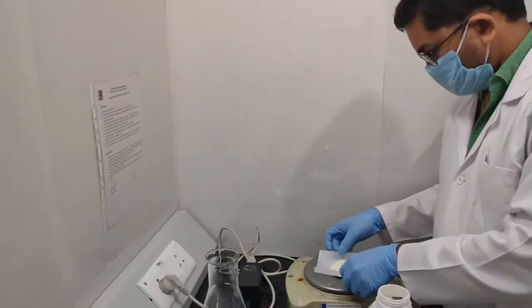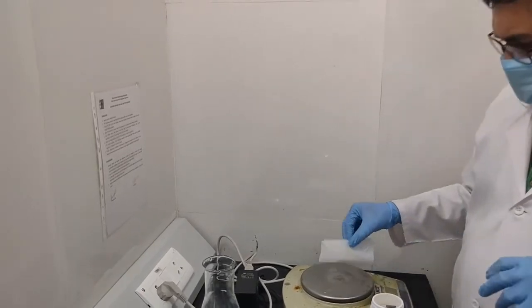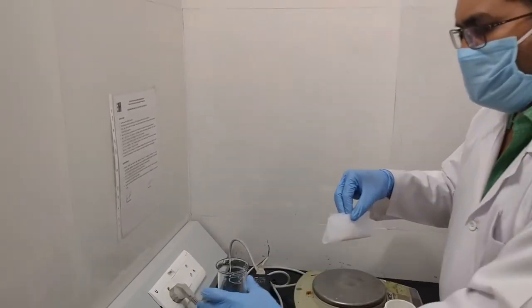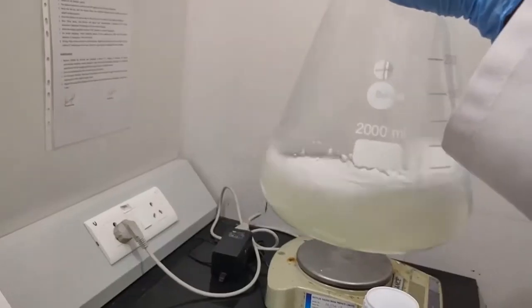To prepare 1 liter of medium, 31.5 grams of powder as given on the bottle should be added into 1 liter of distilled water and dissolved completely.